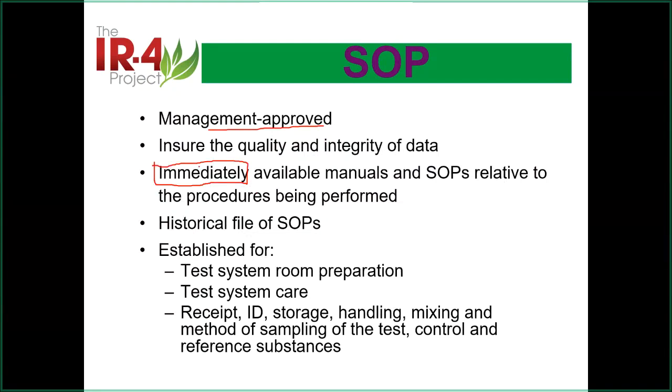So that's some kind of thing. When the inspector comes to a lab, they always ask this question first. So the easiest practice, which I do in my lab, is you print a copy and put this copy in each of the labs. Okay, that makes it a little bit easier, because when people say, do you have it?